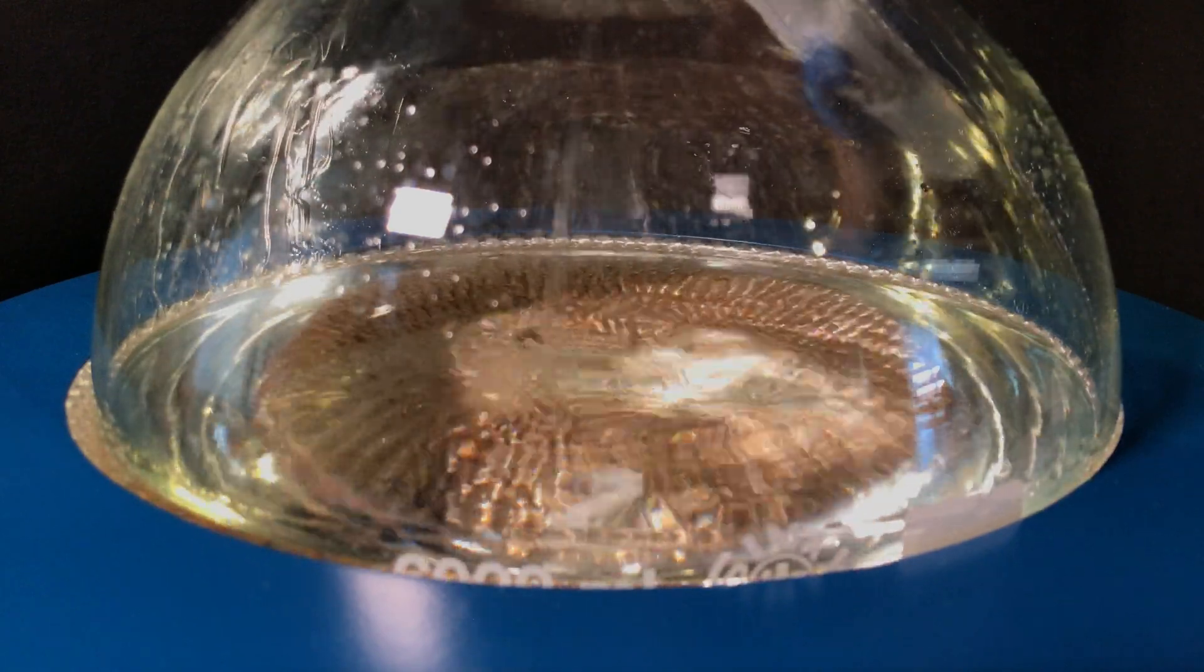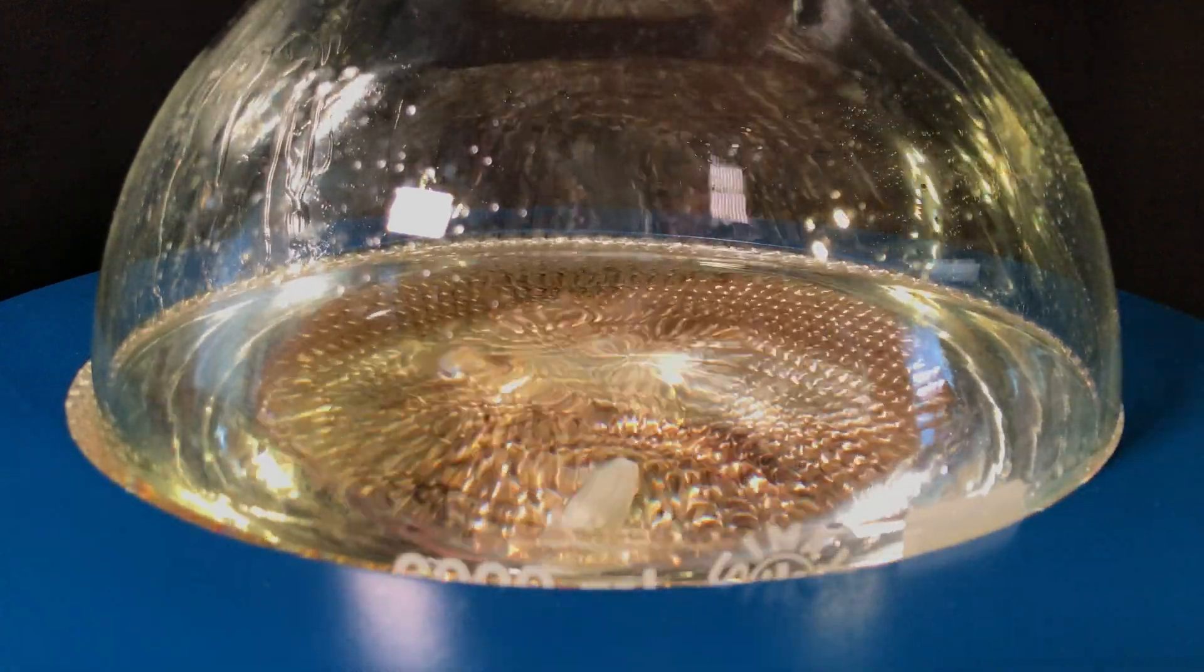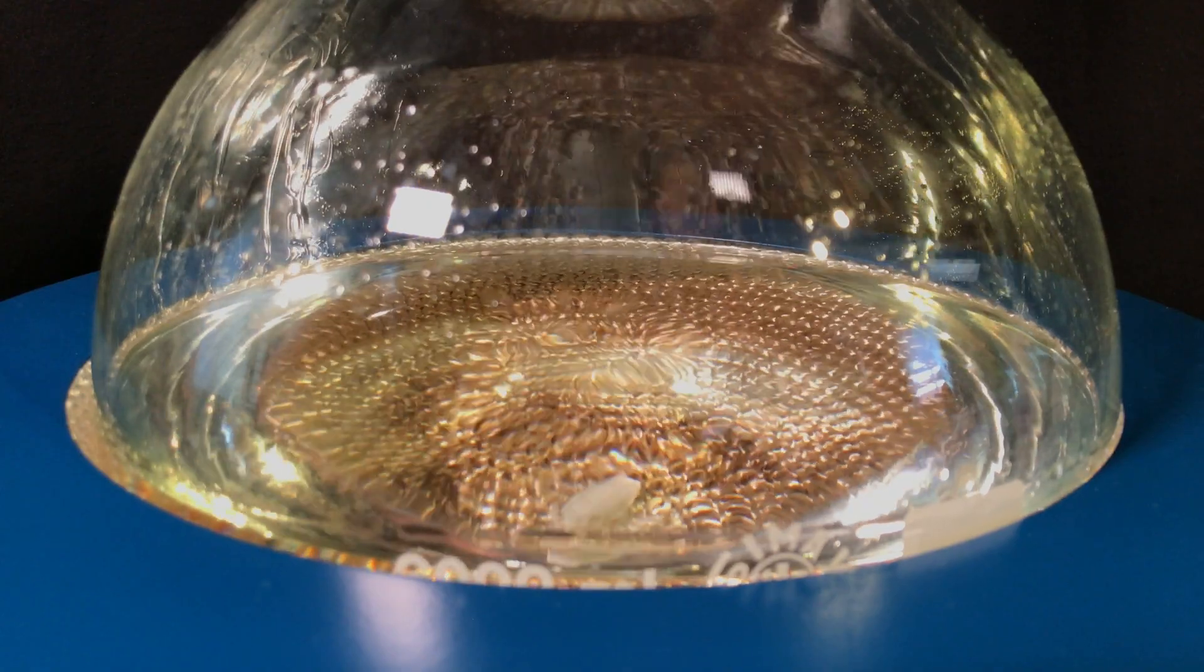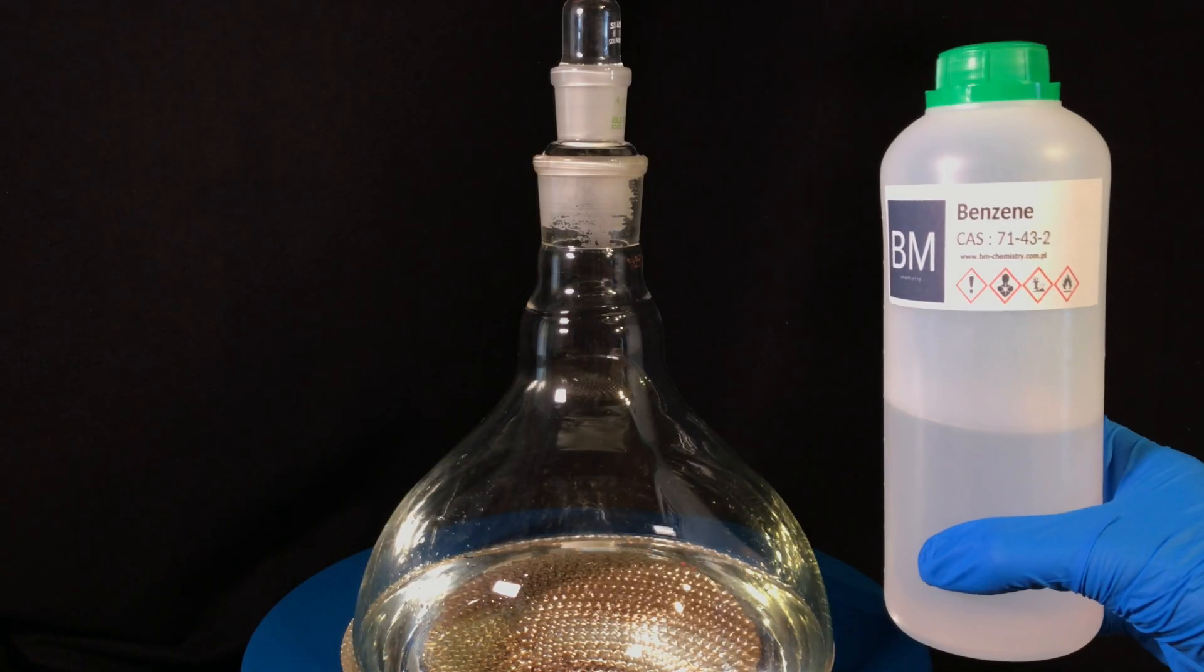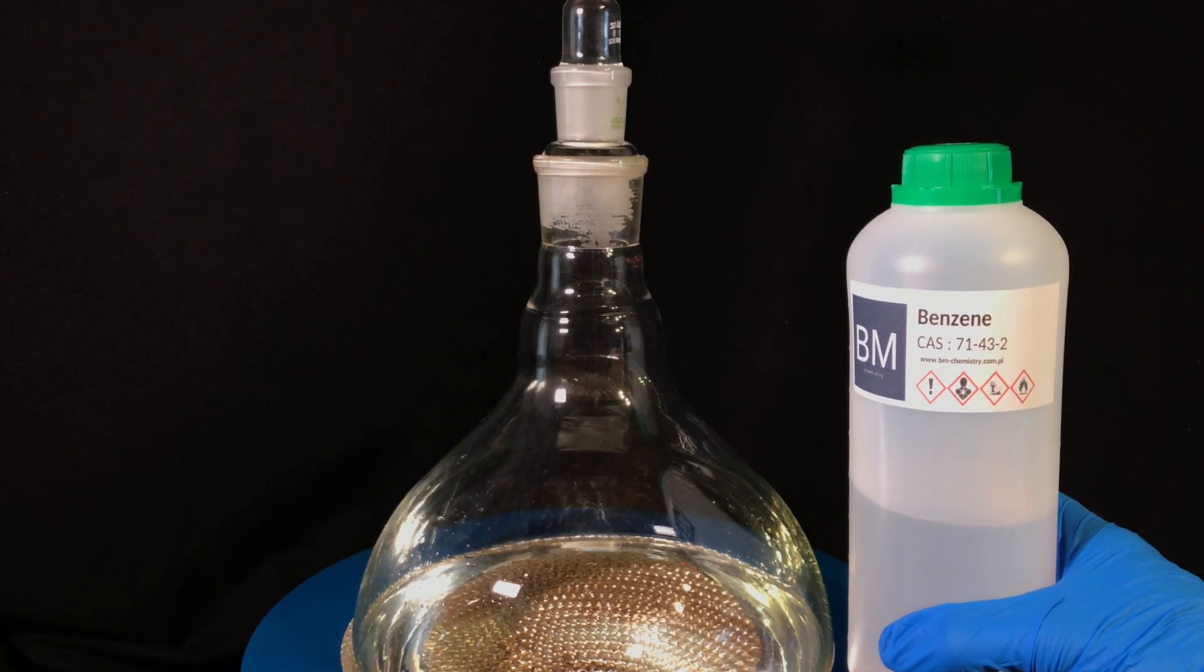So use more ethylene glycol than you think you need, and we ended up using 718g. The last liquid we're going to add before adding the catalyst is going to be benzene.